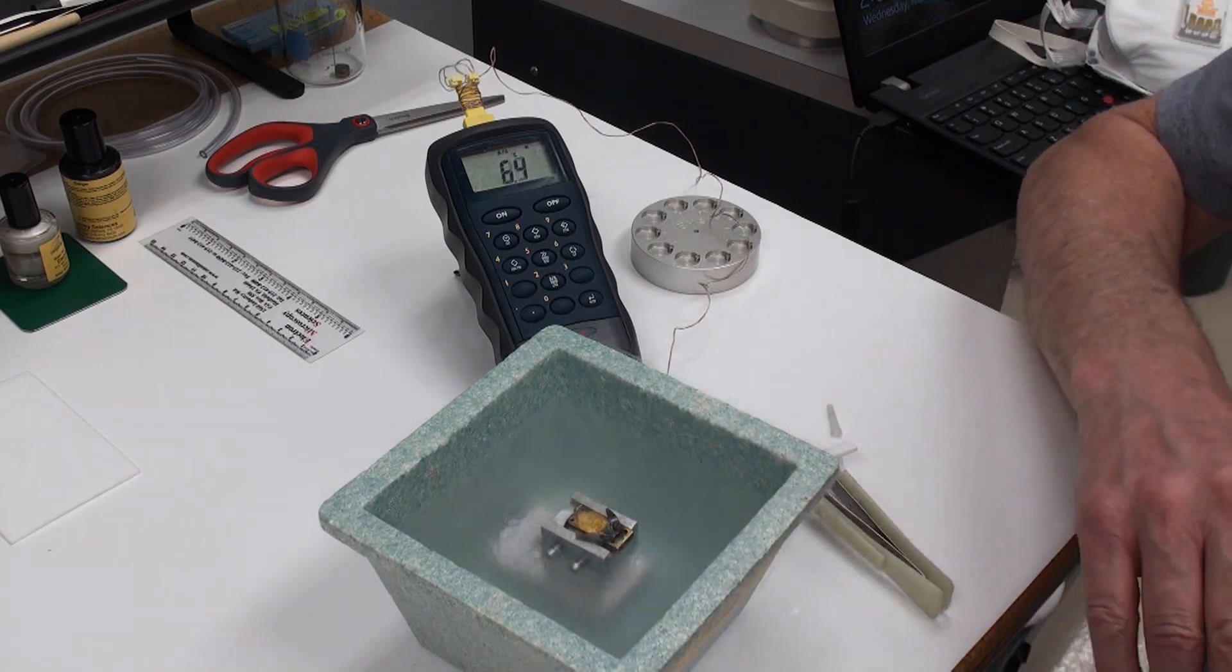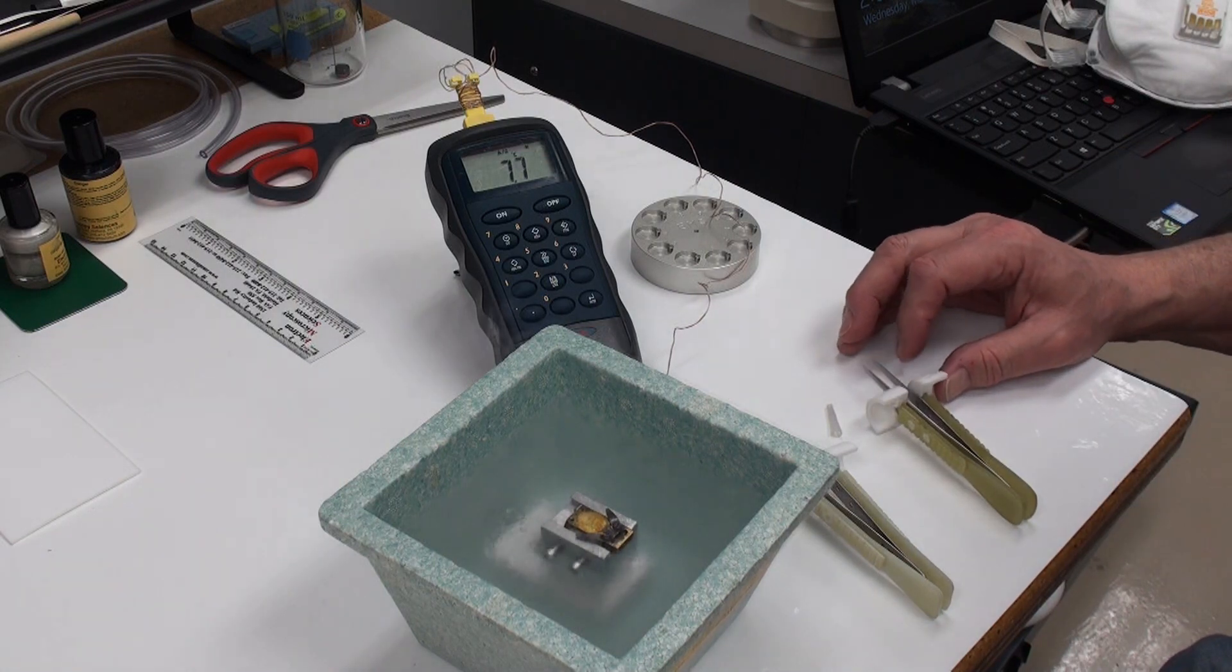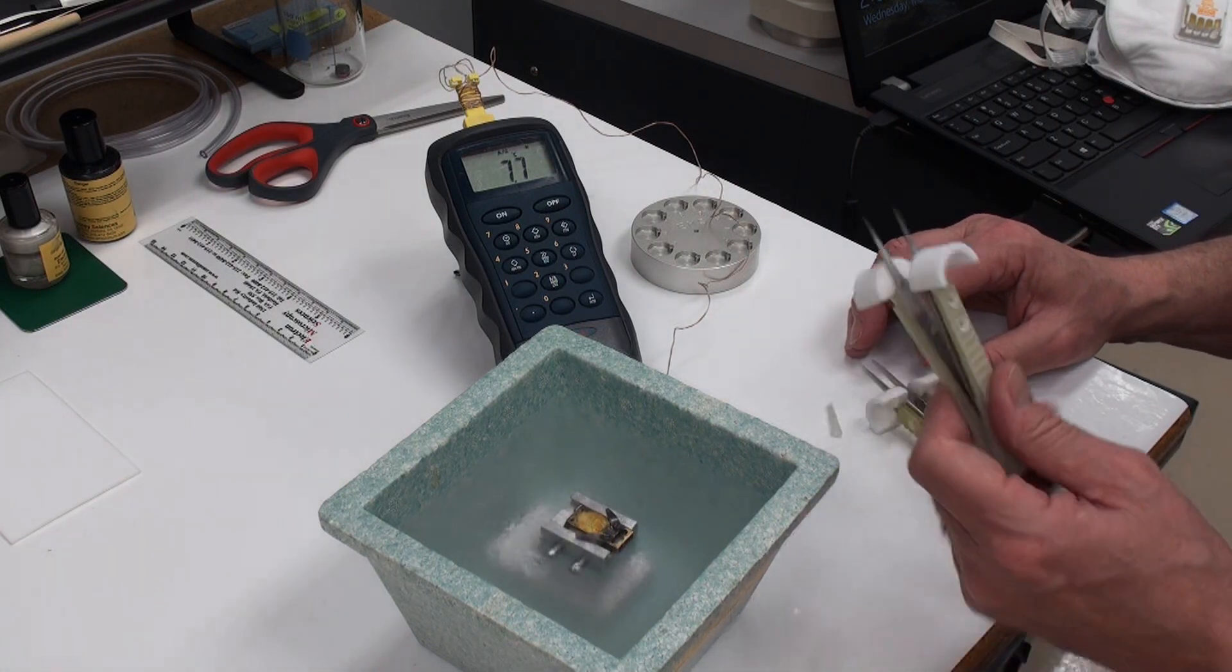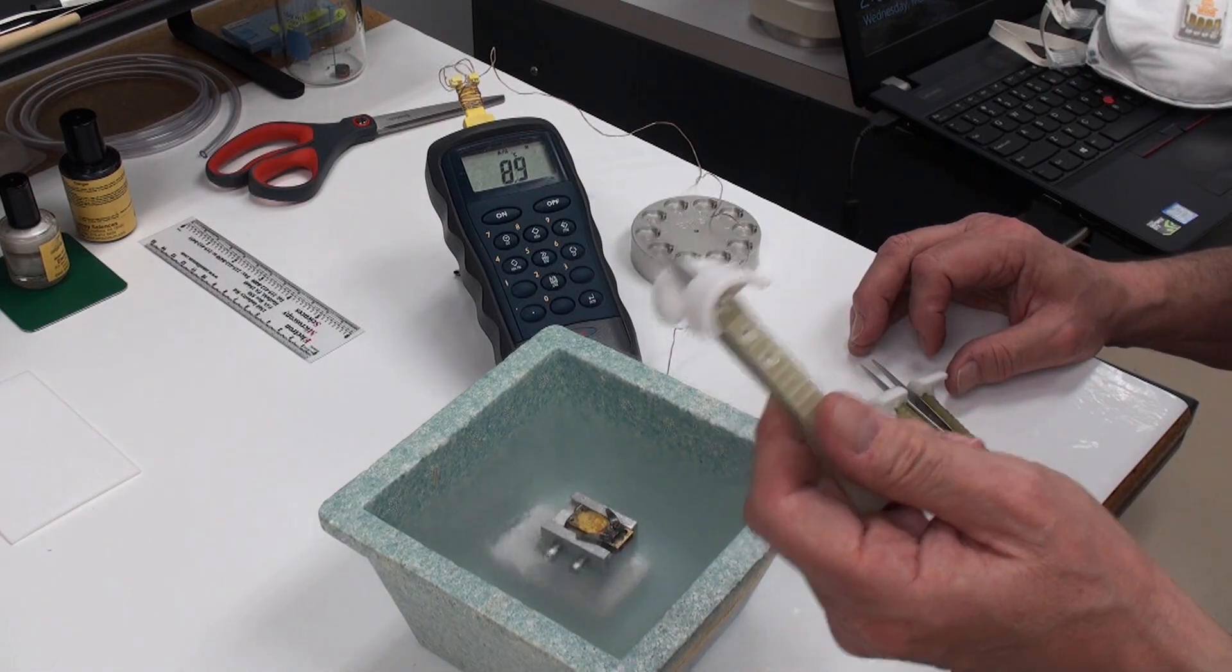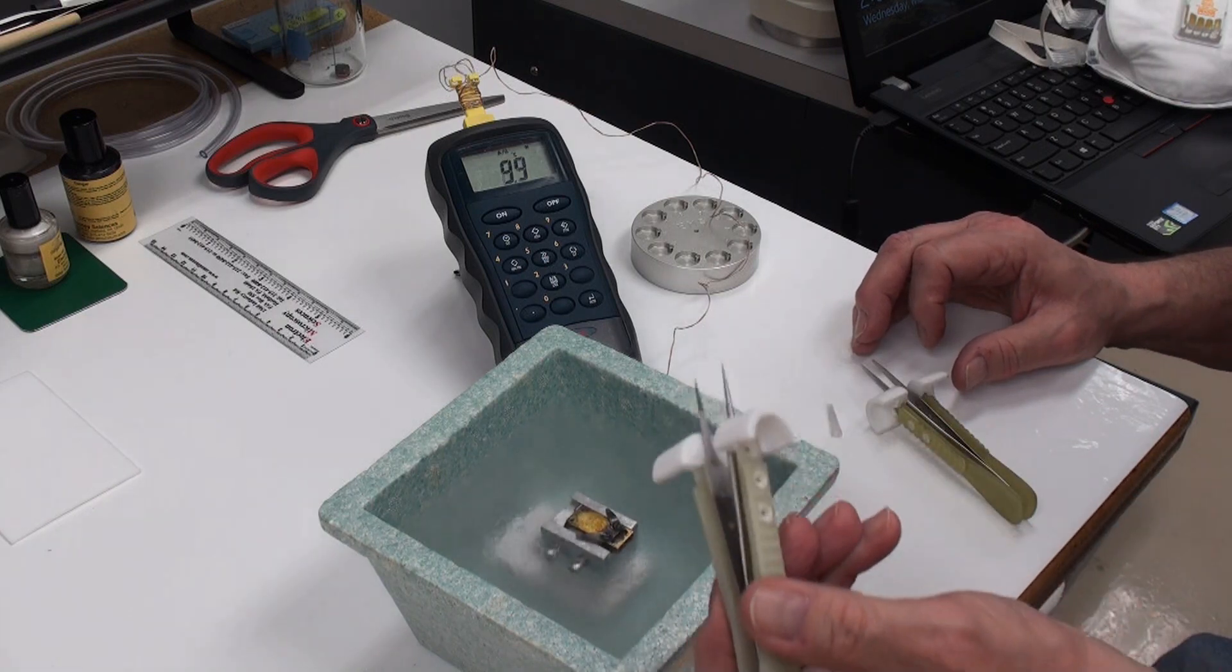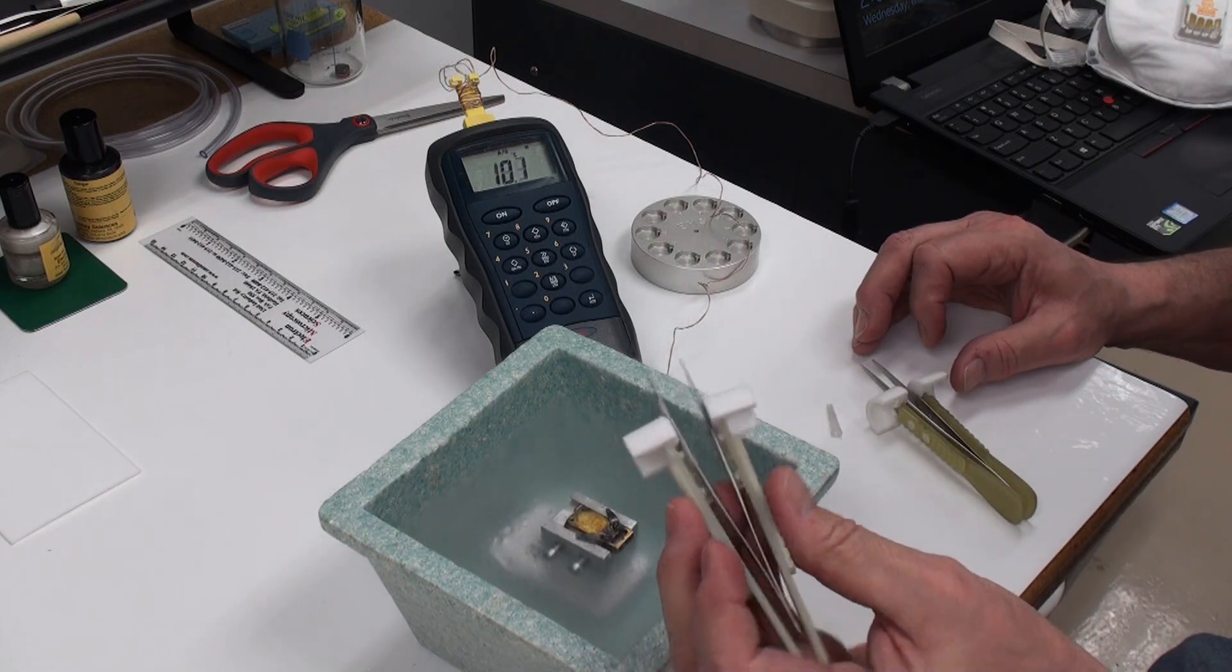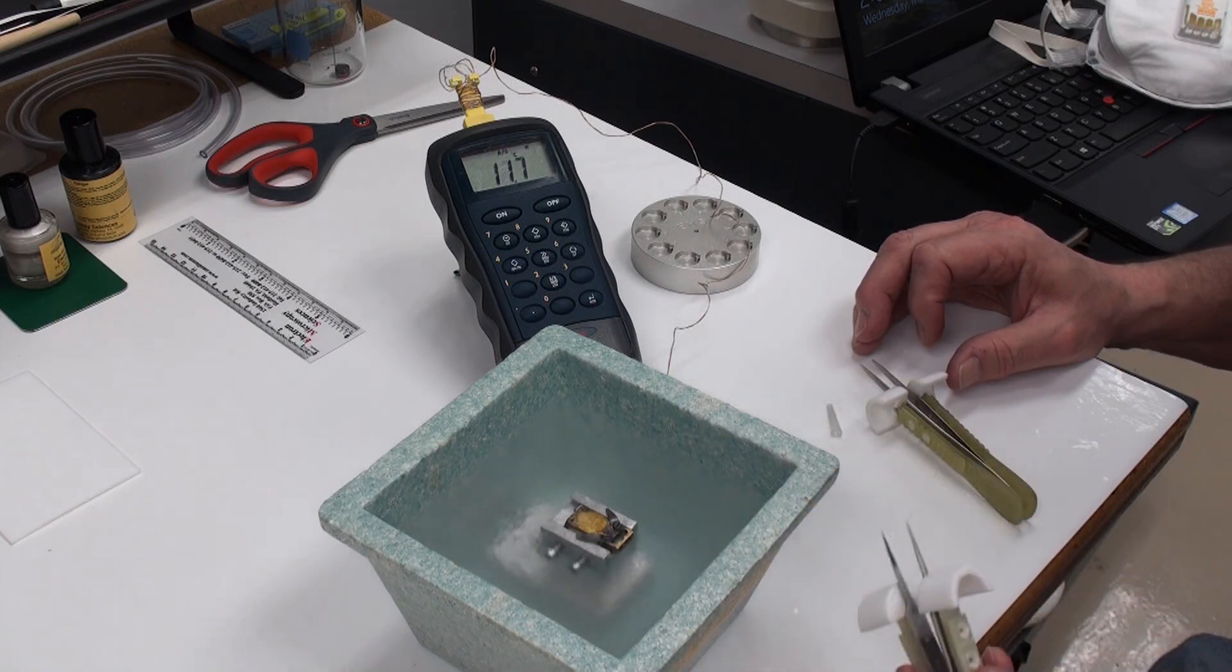Everybody has their own personal preferences when they're working with forceps, but we chose to initially market number five pair of forceps because that has the finest point and will allow you to manipulate tiny little auto grids and things for cryo TEM.